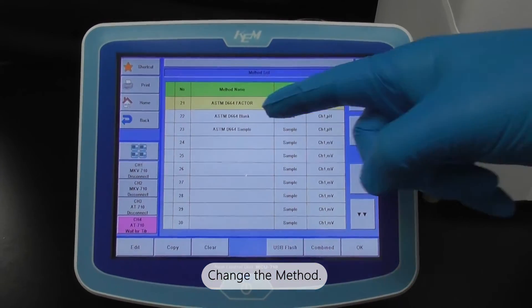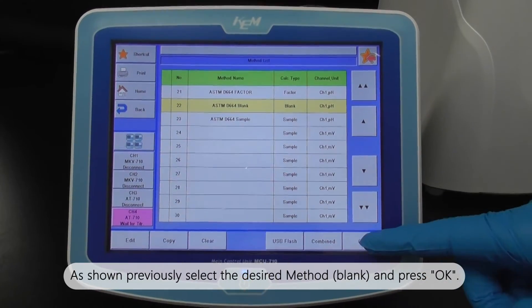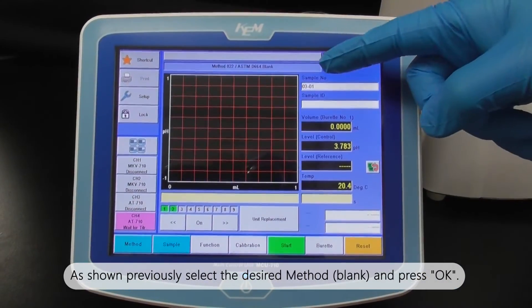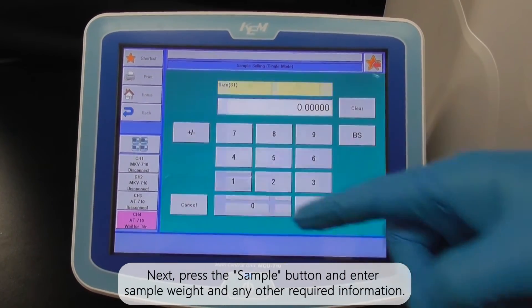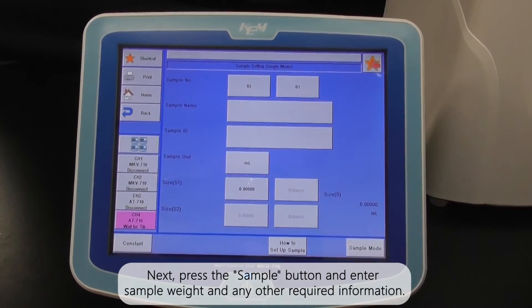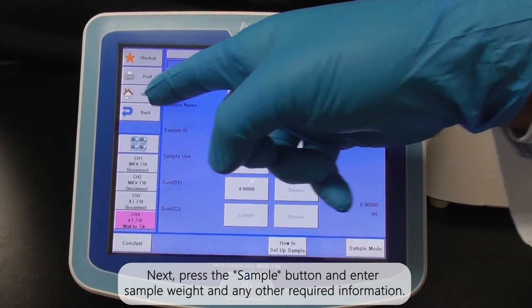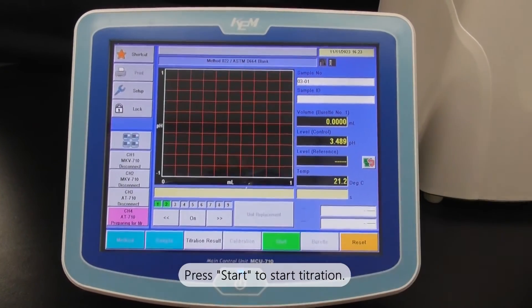Change the method. As shown previously, select the desired method, blank, and press OK. Next, press the sample button and enter sample weight and any other required information. Press start to start titration.